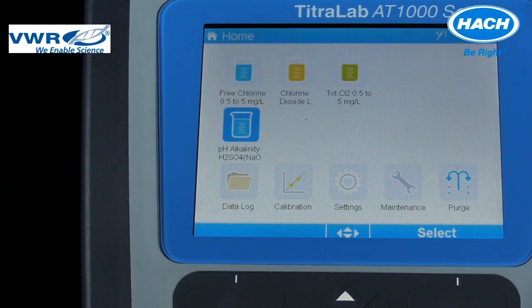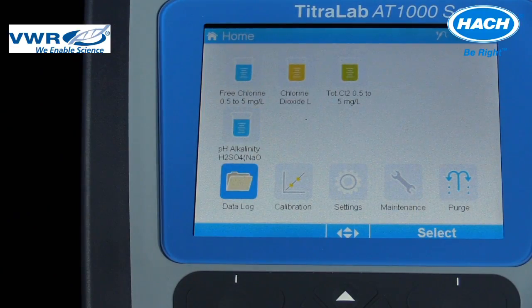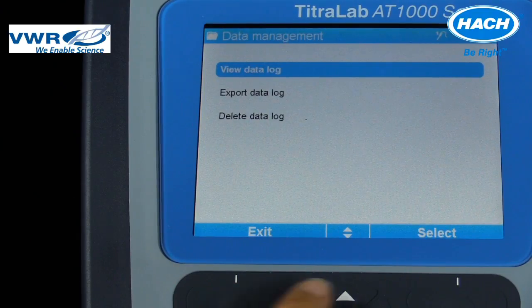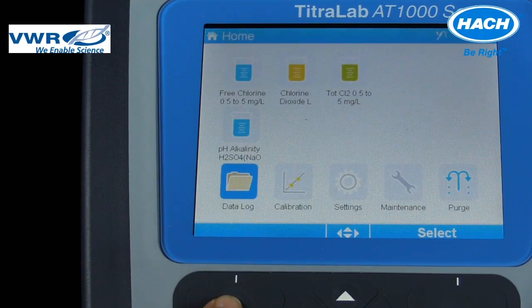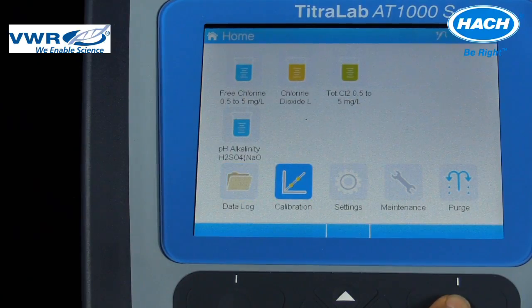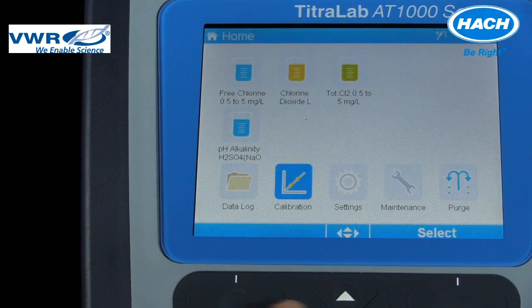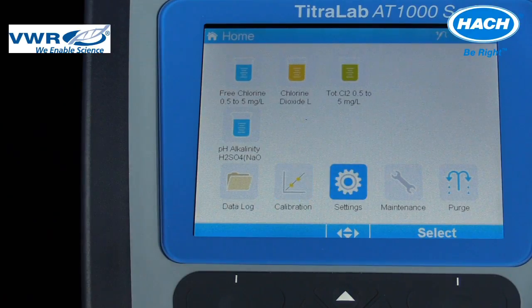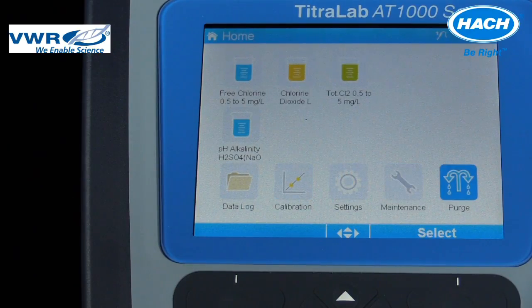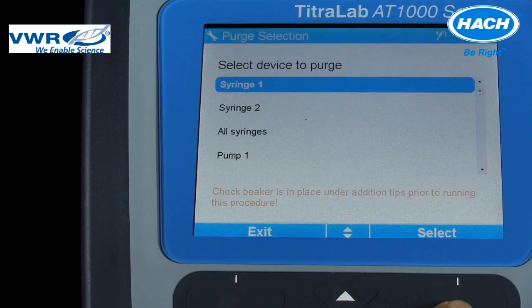The row on the home screen accesses the following menus: the data log to view, export, or delete measurement data; access the calibration settings to calibrate the electrode or titrant; and the purge button, which causes the titrator to purge the syringe or pump. This refers to the emptying and filling of titrant solution in the syringes and dispensing a fresh reagent solution using the pump.